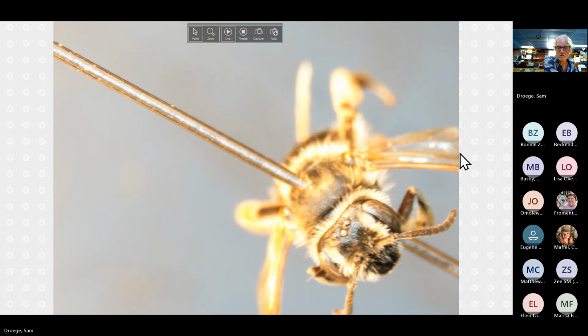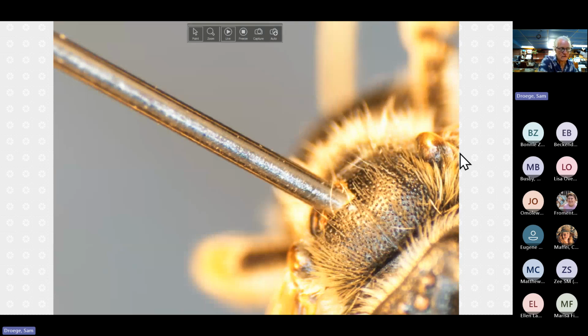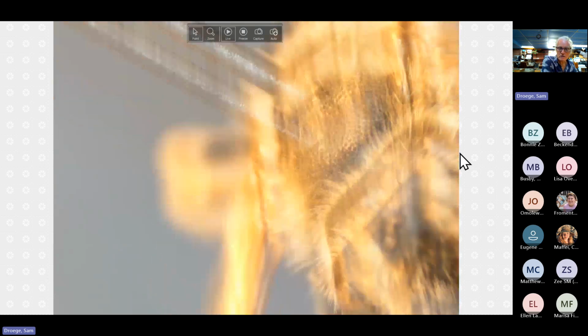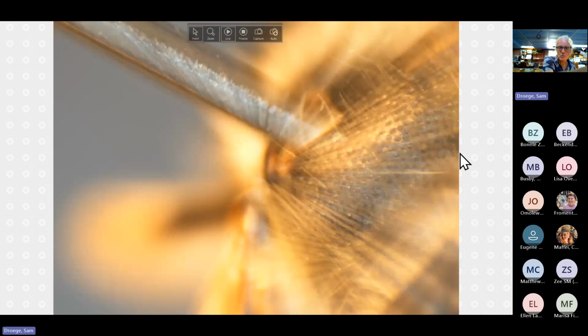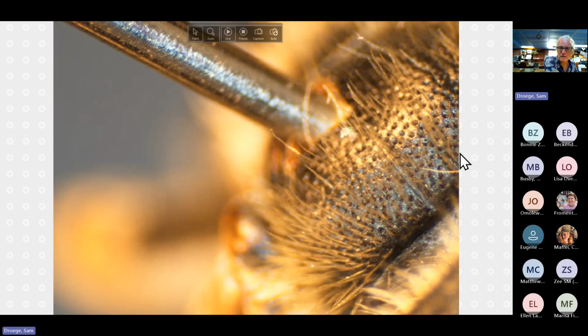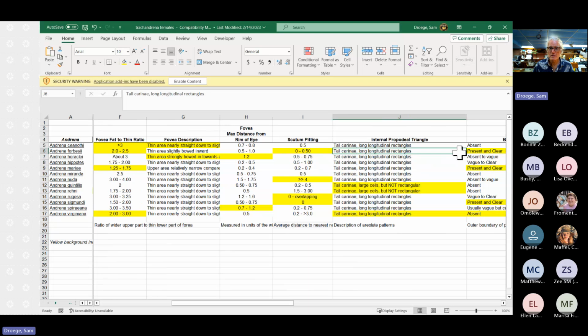And this is a slow, but I think that's a good enough angle here. In this particular one, we certainly aren't touching one another, but we're also not very, I'm going to take it up even more. But you can see that the gap between those on average is very close. Most of them, a few are touching, but most are within half a pit distance from another pit. So what we're saying is a lot of pits very close together, and that's our measurement, in pit distances.